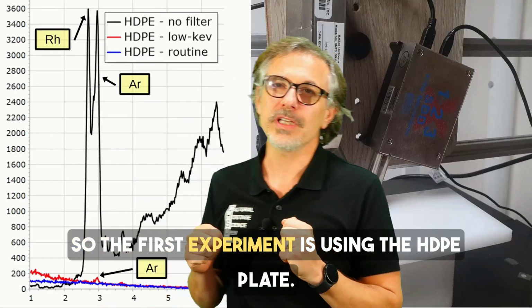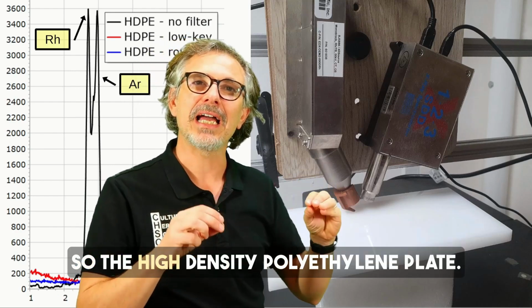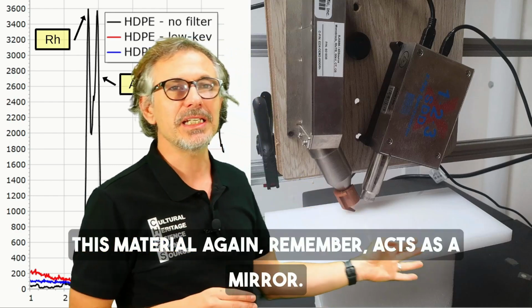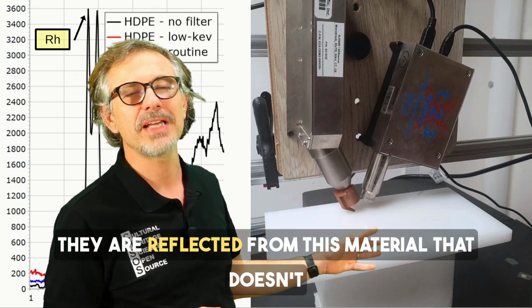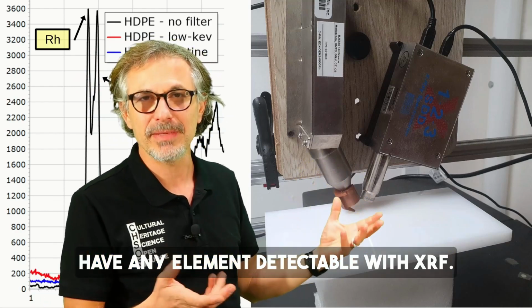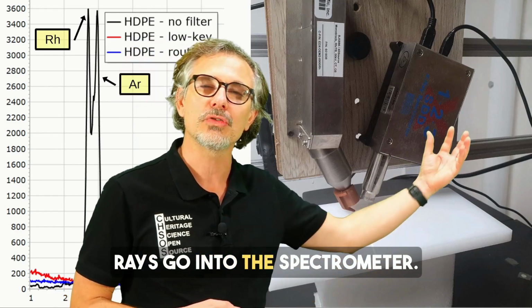So the first experiment uses the HDPE plate, the high density polyethylene plate. Remember, this material acts as a mirror: the X-rays from the tube are reflected from this material, which doesn't have any element detectable with XRF, and the signal goes into the spectrometer.